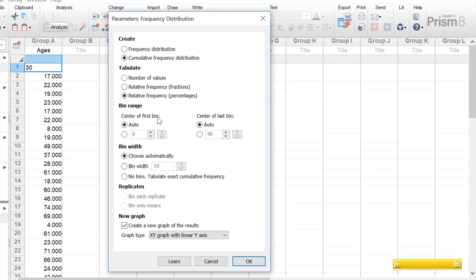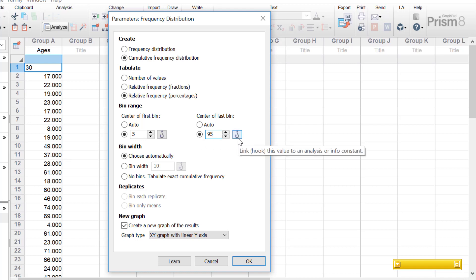There's also the bin range, where you can define the bin range yourself or let GraphPad do it for you. By default, the center of the first and the center of the last bin are set to auto, meaning GraphPad will define the best center values. You can also define your own by clicking the box and entering a value — for example, setting 5 as the center of the first bin and 95 as the center of the last. Alternatively, you can hook a value from previous analyses or the info sheet.